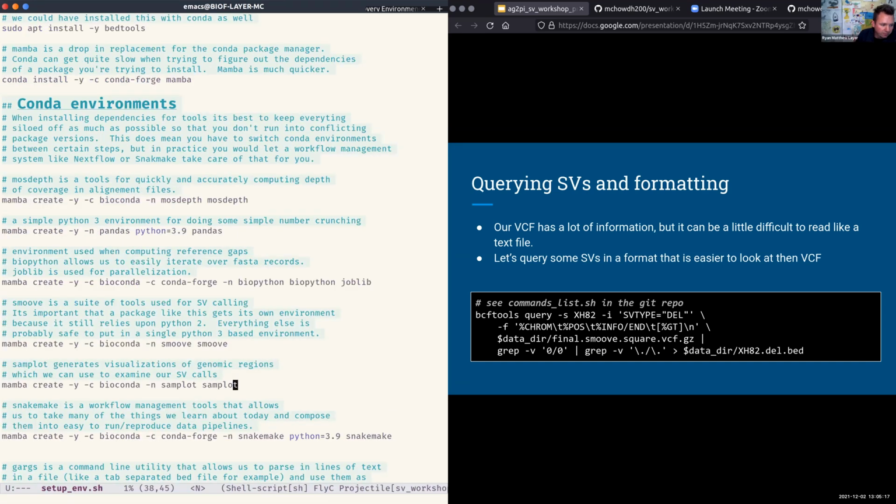So it's a virtual environment. Once you start it, you can start installing all these tools and specifically customizing your runtime environment. And those tools and their specific versions and all those settings will be isolated to that virtual environment. So you can have multiple, and we do have multiple different virtual environments for different processes.